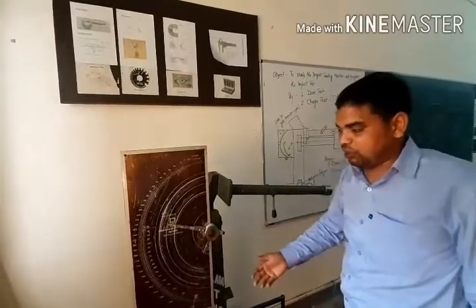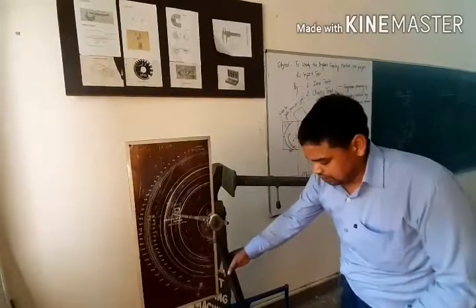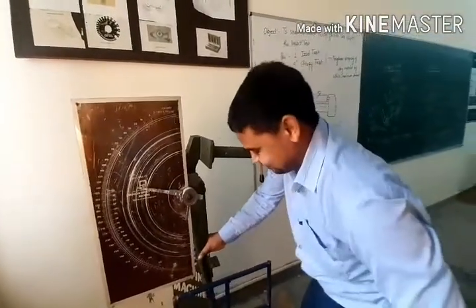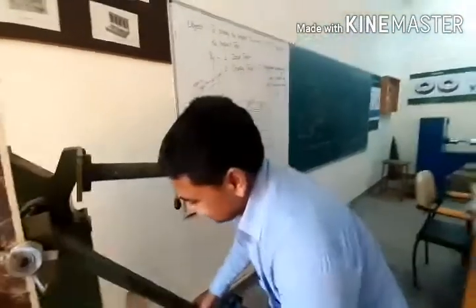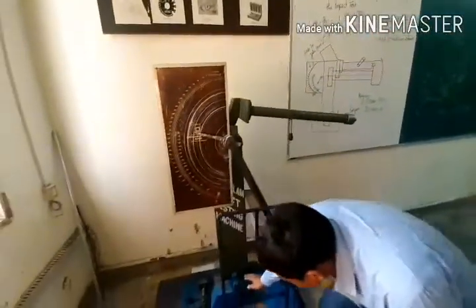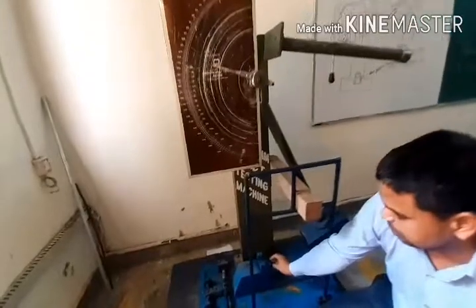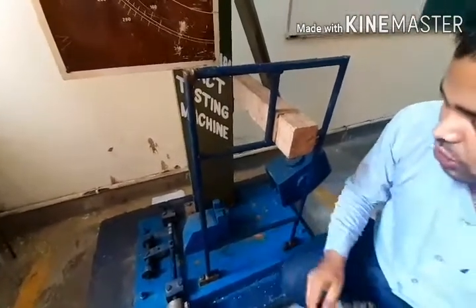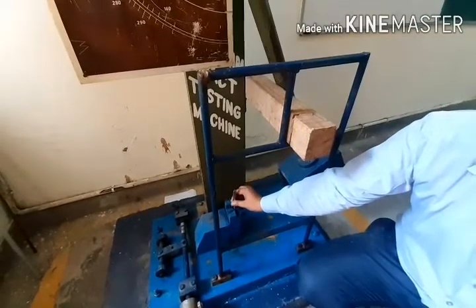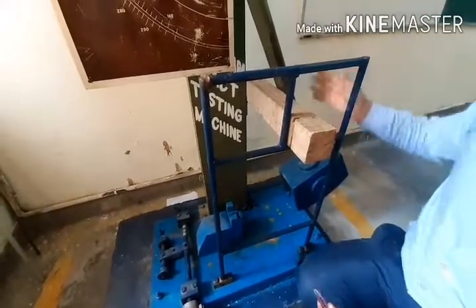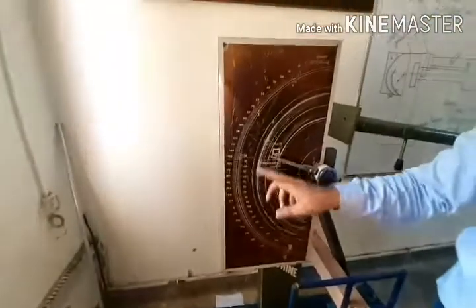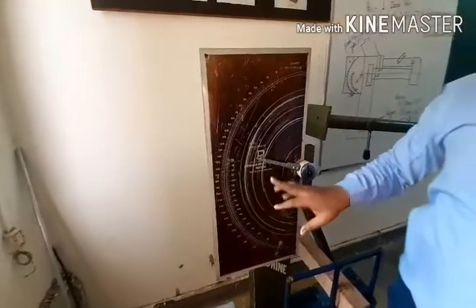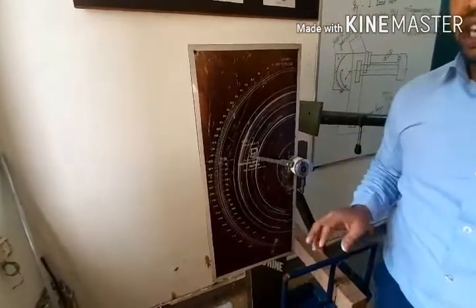In the next step, here is the table where we mount the specimen. I will mount the specimen here, then strike it again. I will note the difference. If there is a difference between your free energy reading and the post-strike energy reading, that indicates the toughness value of that specimen.